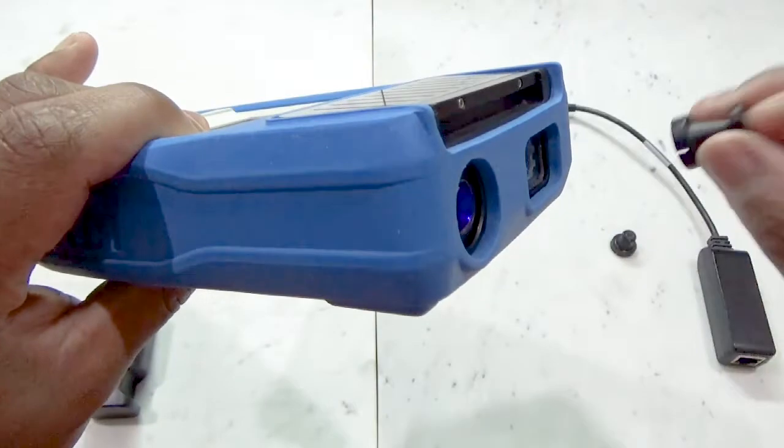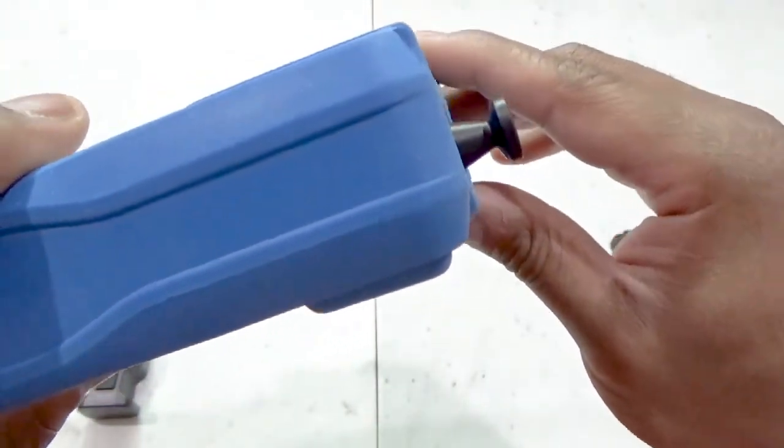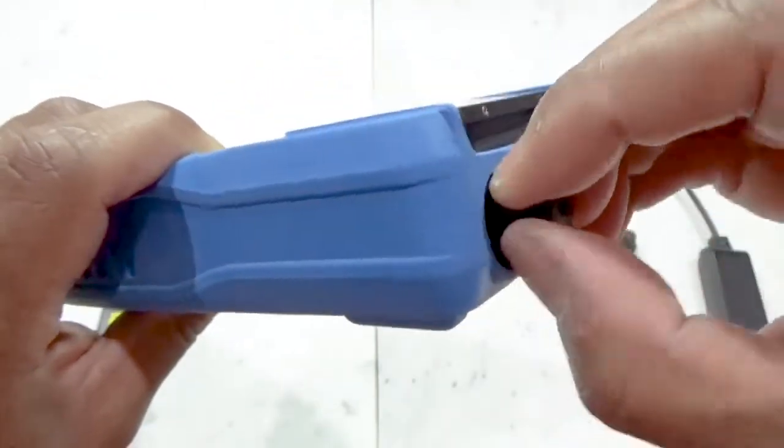TruScan also has another nose cone attachment that is slightly longer with a blunt end. This nose cone also does not change the normal focal point, but because it is longer, the focal point is now at point of contact.